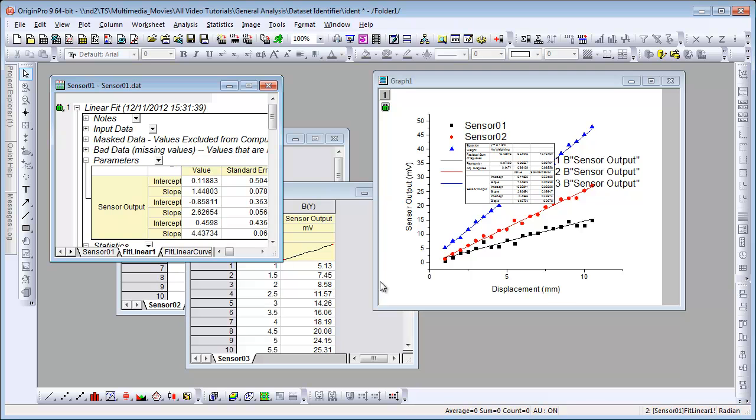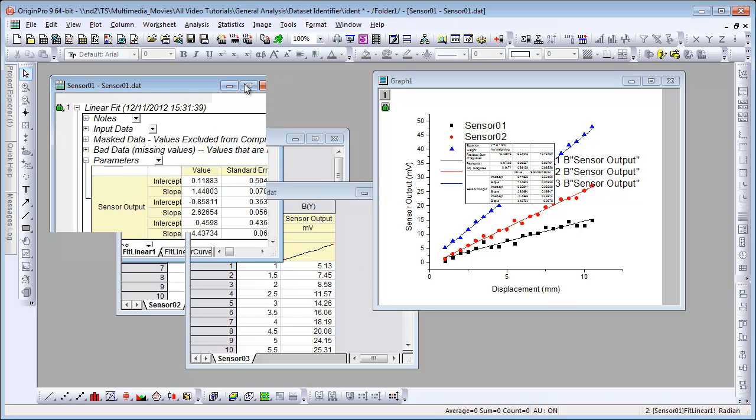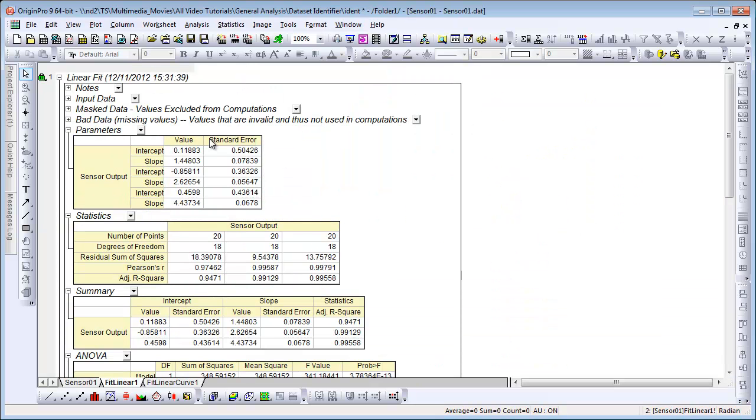We're going to switch to the report sheet and then look at the parameters table here. It just says Sensor Output, so it's using the long name, and it combined that because it was the same. But now we have no way of properly knowing which data set the intercept and slope are for in this case.